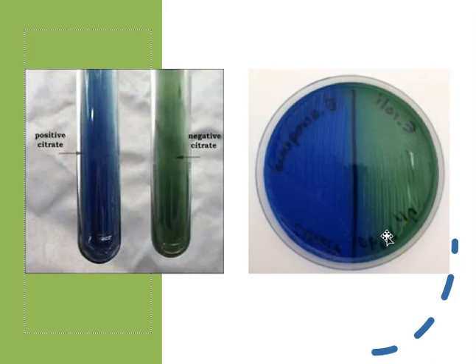It cannot convert citrate all the way to pyruvate. Enterobacter aerogenes, on the other hand, has that enzyme. It can take the citrate in the medium and help convert it to pyruvate. Then the CO2 that's produced during that reaction will be converted into that alkaline metabolite, and the medium will turn blue.